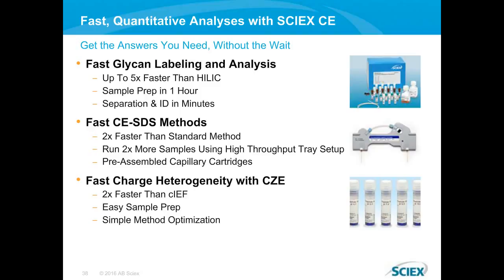Perfect. All right, our first question is, is the data quality of the FAST CE-SDS option you mentioned similar to the regular kit method I now use? Yeah, so the quality of the data that you get is going to be very similar to the... and this is specifically, I think you mentioned for the FAST CE-SDS assay, correct?